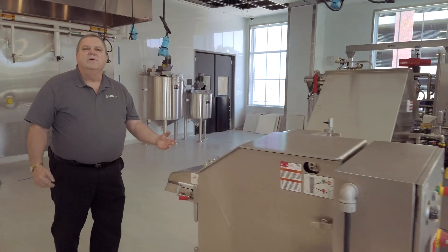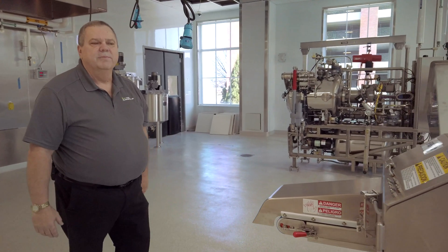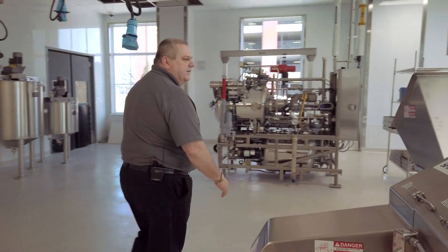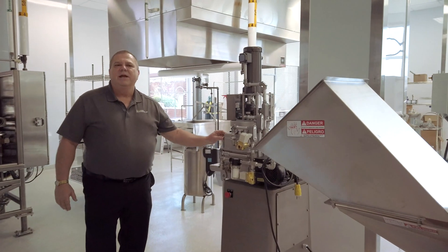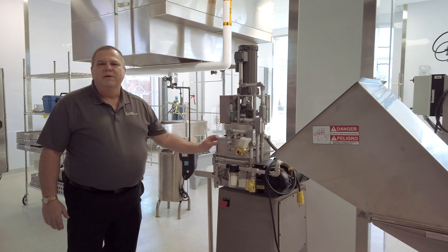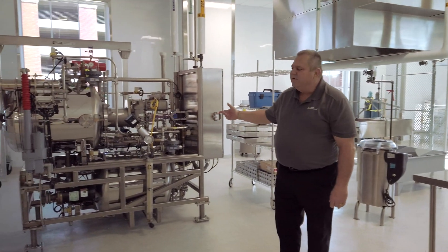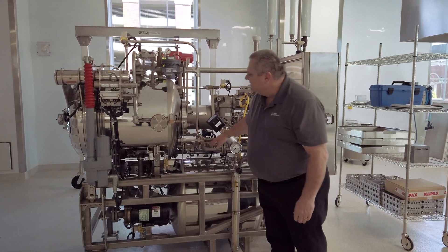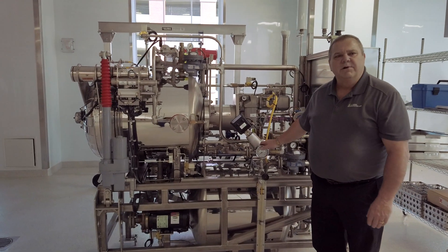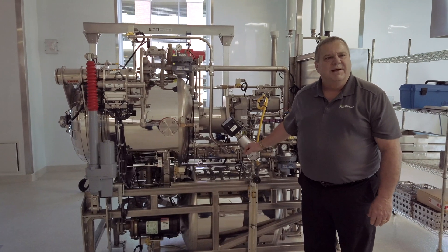Some people want to retort their product — put it in cans and have it sterilized so it can be shelf stable for a number of months or years. The first step after we fill a can is to put it in this machine and seal the tin or aluminum can. From there we go to the Alpax 2402 retort, which is equipped with computerization so we can determine our thermal death time curves and process the product to make it as sterile as possible.